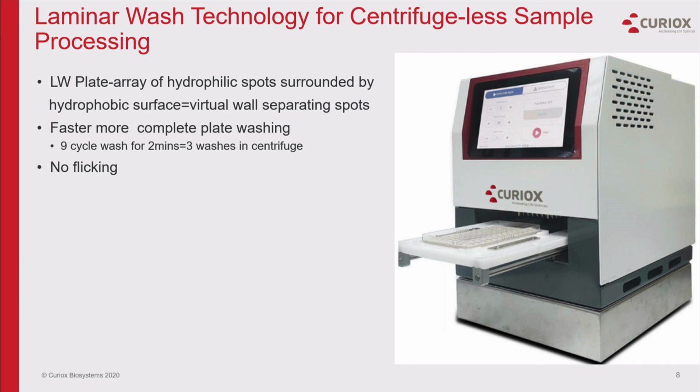So now they've got residual fluid, they're losing their cells, or they flick and then they tap their plate onto, like, a diaper that's on the lab bench to get rid of any extra fluid. And when that happens, that can drain cells out of your well and onto that diaper.